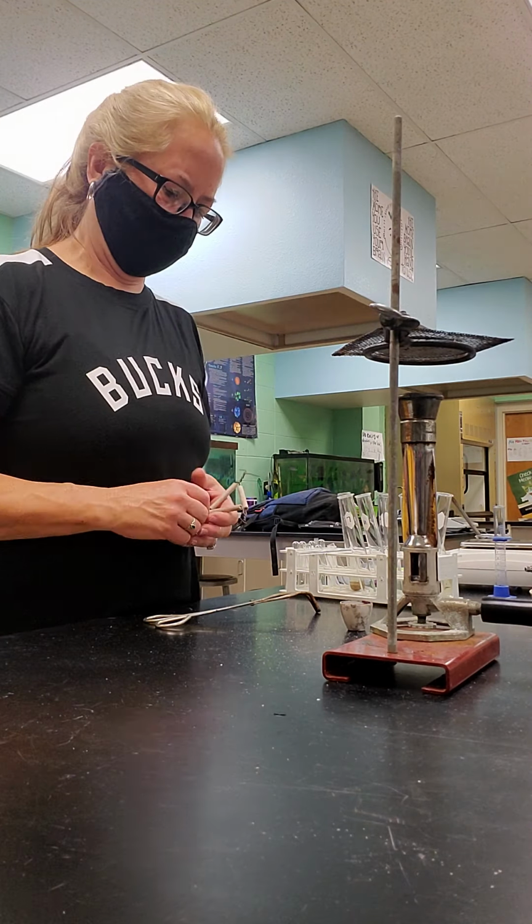Okay, now we always point the mouth of the test tube at the wall so nothing comes out of it. We've got it set up. My sugar is in there. Okay, so we'll heat this up. Come on. Ugh, I ran out of gas. All right, sorry, ran out of gas.